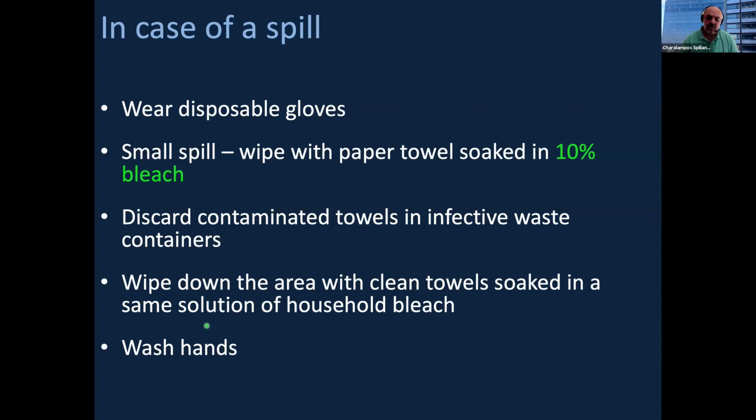Definitely the safety officer, and you've seen from Petros the phone numbers of all the people responsible for biosafety at the IMBB, so the biosafety officer should be informed, and definitely the principal investigator, the person responsible in the lab. Now, how you can prepare by yourself different disinfectants. As I said, you can prepare, for example, 10% bleach.